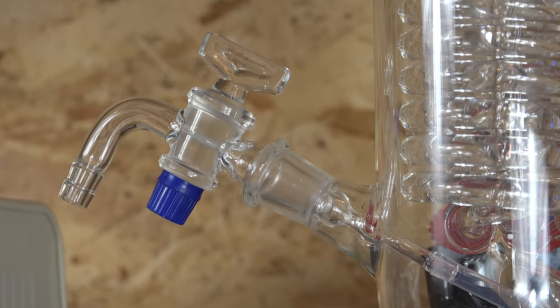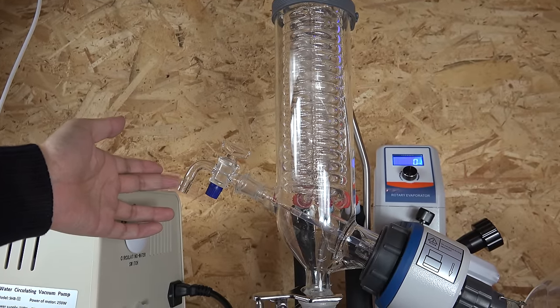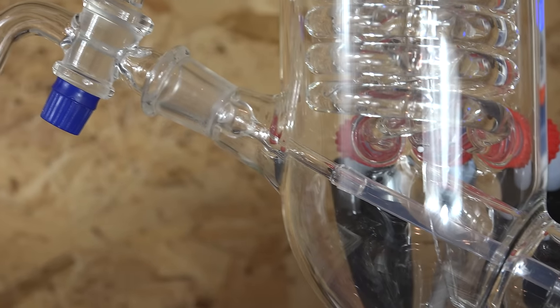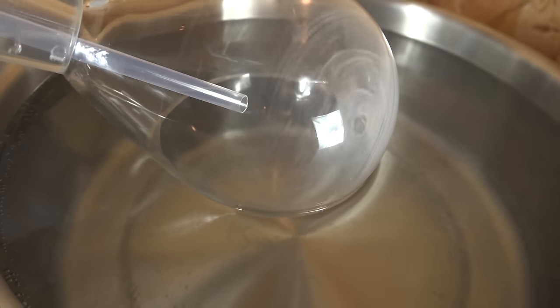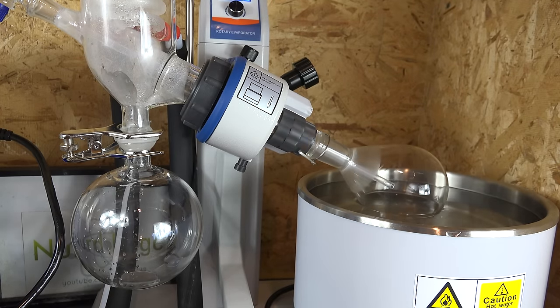We have the gas valve and feed-through line. At the end of a solvent removal procedure we turn off the vacuum and let air or gas back in through this valve — it's designed with a hose barb so we can connect different gases. For example, if we're working with air-sensitive compounds we may connect this to a nitrogen line and fill the system with nitrogen gas. But most of the time we'll just be opening it to air. I want to draw your attention to this gas feed-through tube inside the system that goes all the way to the product flask — the incoming air exits through this tube. By filling the product flask with air here, it lets us purge the flask of any lingering vapors at the end of the solvent removal procedure, which is useful in case we're dealing with highly toxic solvents.